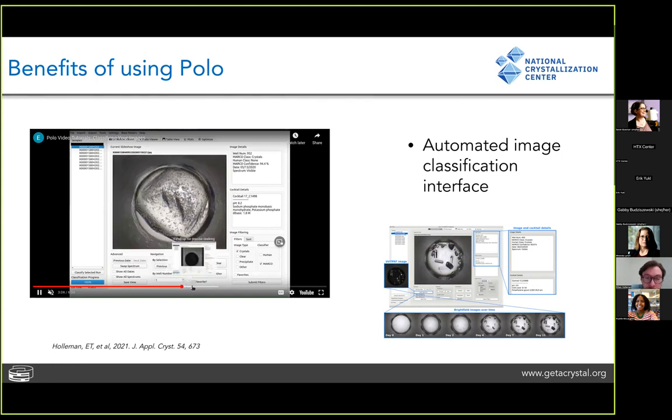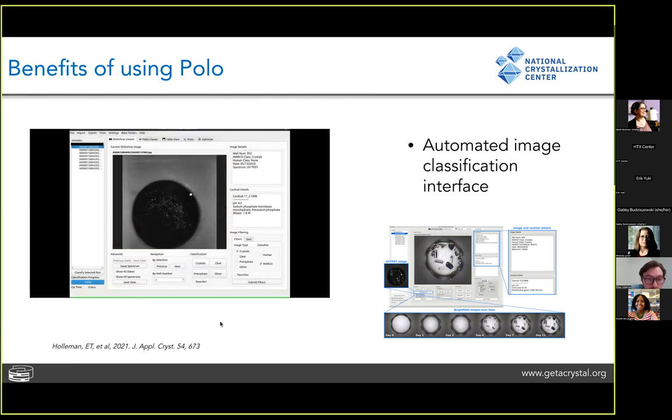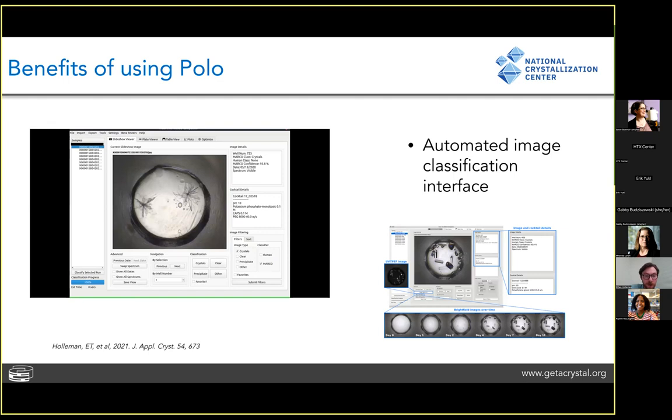But again, this might be an opportunity to look at your UV-TPEF spectrum to see if those are salts or what they might actually be, because again, the model is not perfect, and so you're going to need to go back and look at the ones that were classified as crystals just to verify that, right? And so that's what we're doing here.